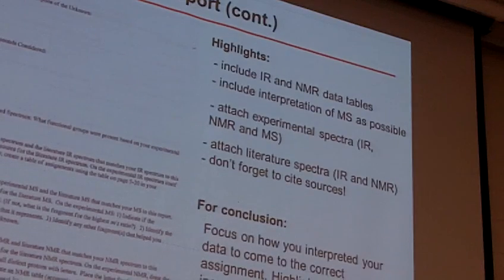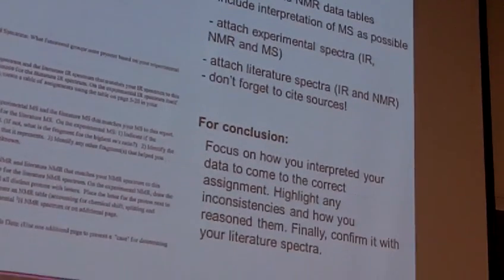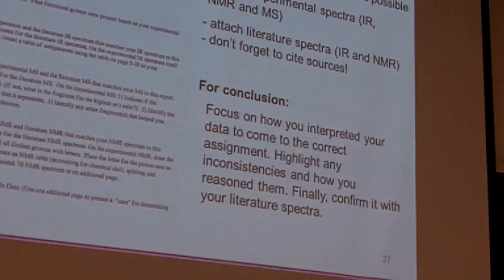On the conclusion, what I really like to emphasize is again, focus on the interpretation of everything, and then match it at the end. This is why I think I have 2-butanol, and then I pulled up the spectra from 2-butanol, and lo and behold, they matched. That's the approach you want to take in writing up that conclusion. Any questions on that?